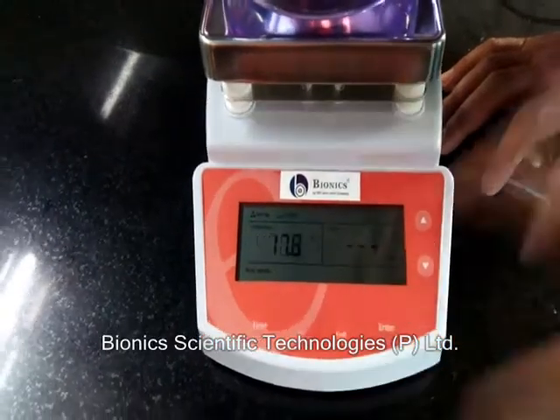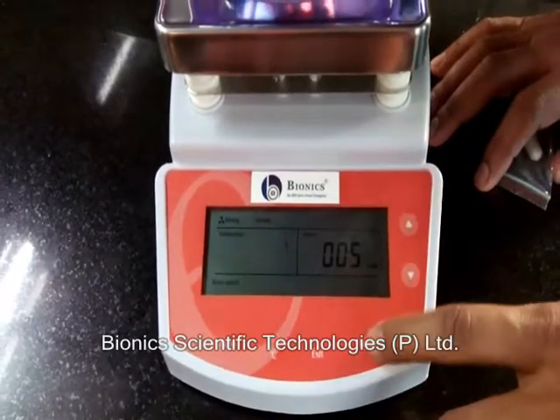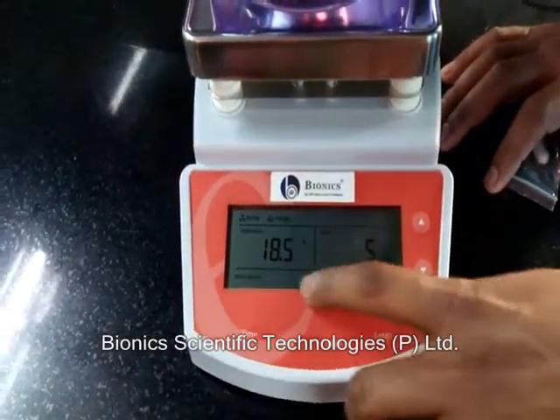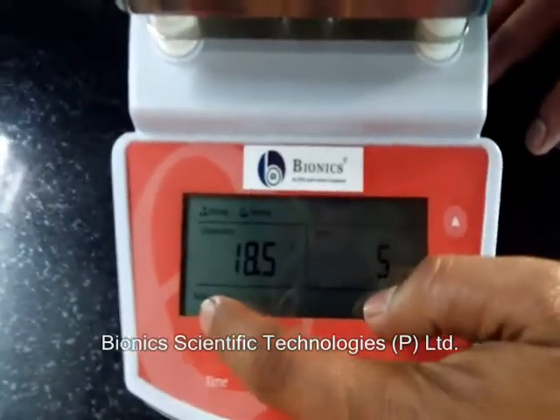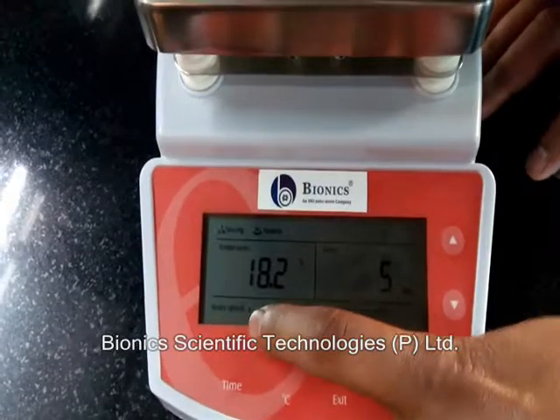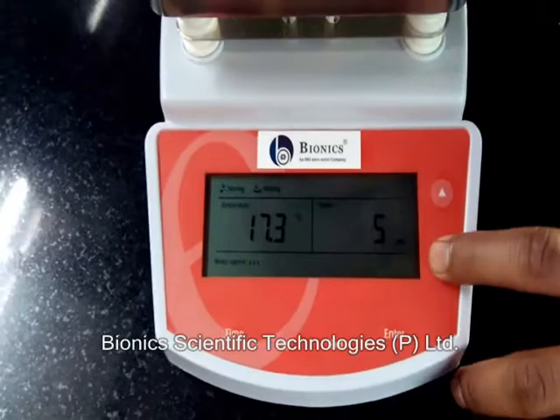We set 400 degrees, enter. Time — we have set five minutes, enter. This is the stirring setting. If you want to set the stirring, we can increase it: two, three, four — it goes up from there.